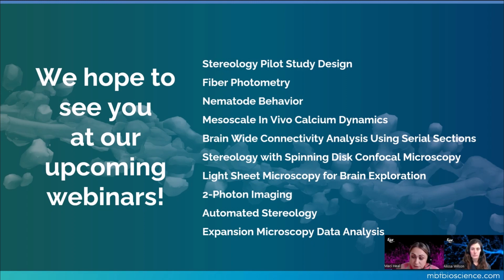If you have light sheet data that you're using in NeuroInfo and you've registered to an atlas and done the automatic delineation of brain regions, of your regions of interest or all of them, you can bring those contours and the image data into Neurolucida 360 and do some morphological reconstruction, and then use, like I showed, the closed surface analysis in Neurolucida Explorer to extract metrics about what's interfacing within that one, or intersecting and enclosed in that volume.